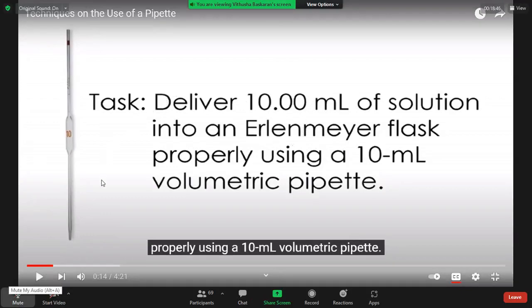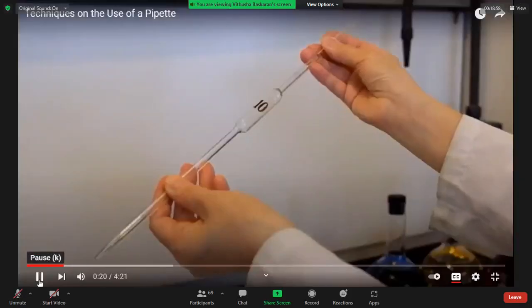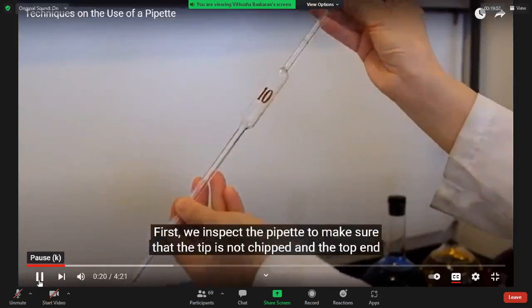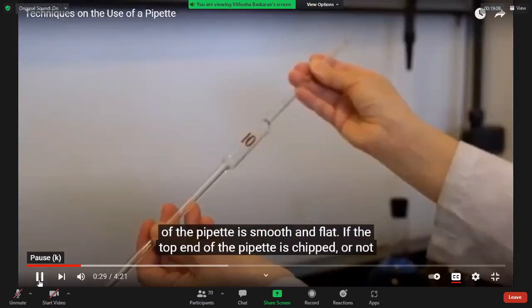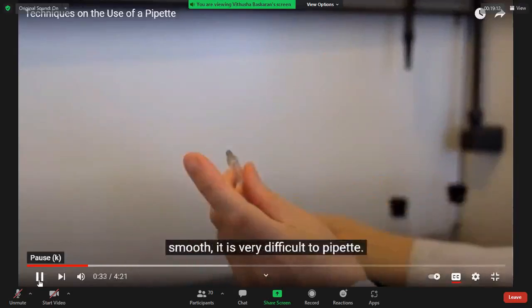Okay. This is about the handling of the transfer pipette. First, we inspect the pipette to make sure that the tip is not chipped and the top end of the pipette is smooth and flat. If the top end of the pipette is chipped or not smooth, it is very difficult to pipette.